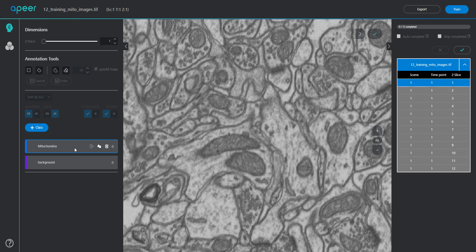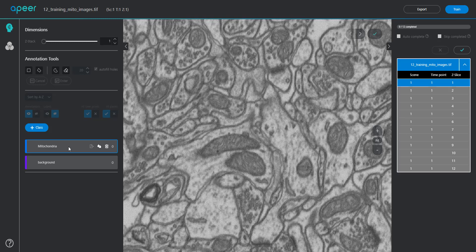Let us start by annotating a few objects. Let us select the mitochondria class and use the paintbrush tool for annotation.